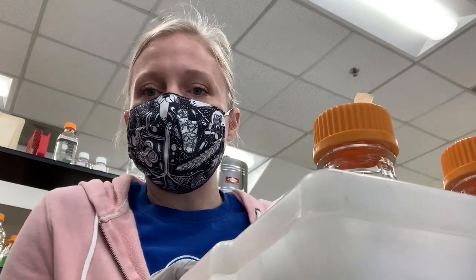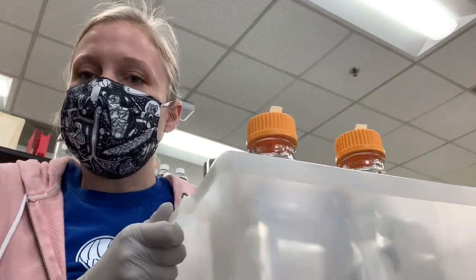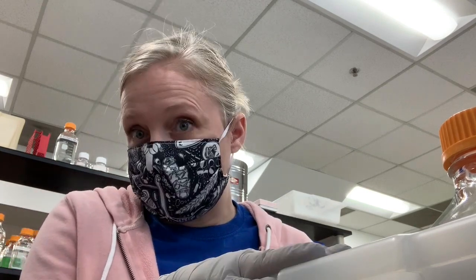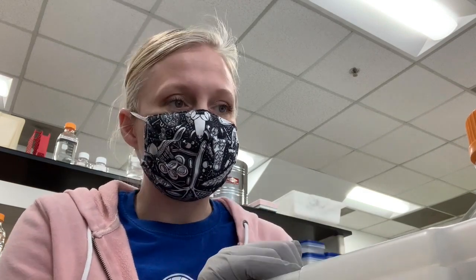Grab one of these, this is like a little tub. There's several of them around the lab. You want to make sure it's one of these Nalgene tubs because this is resistant to heat and can be autoclaved safely. There are some plastics that will melt in the autoclave, so be careful not to do that.